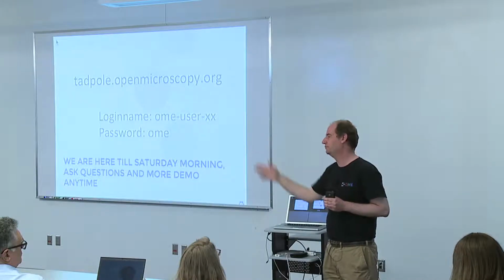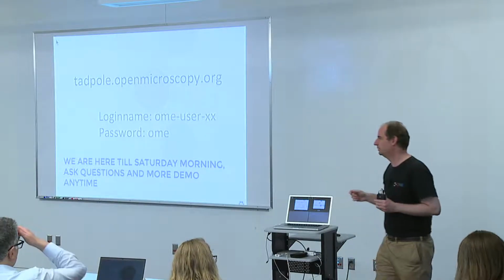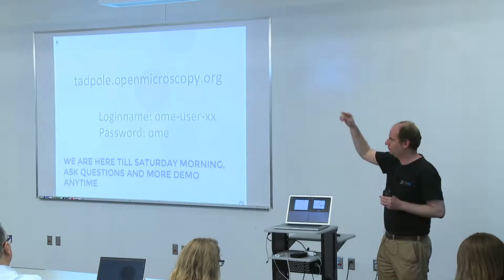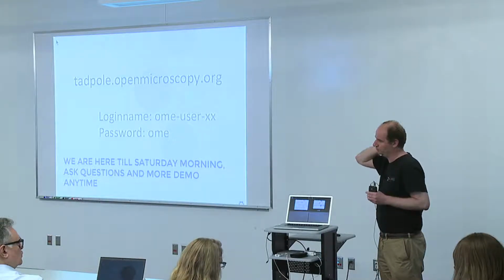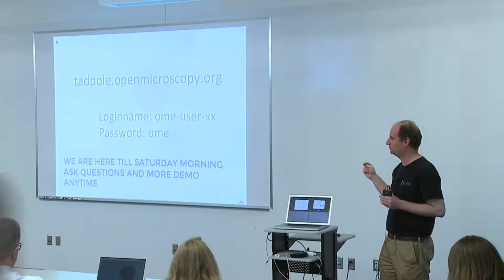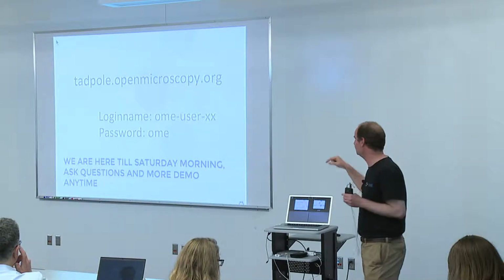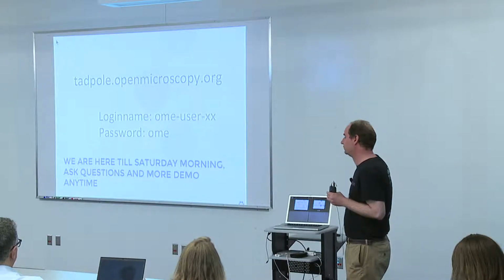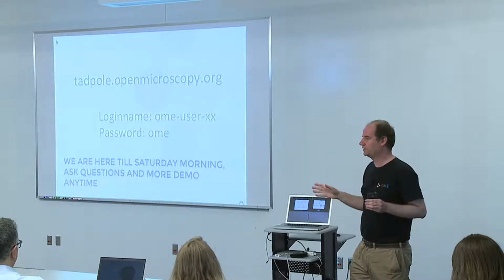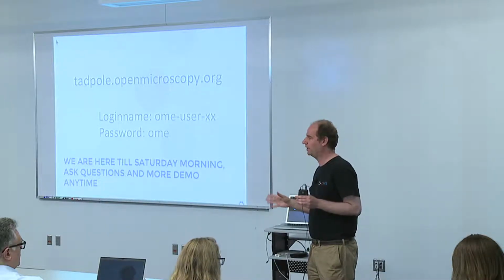Now each of you will have a user name and password according to the small cards, the visit cards, Dominik distributed, and you would have followed the workflow to get into the Open Microscopy network. This will kick you out of the normal internet. So if you can survive without internet for 1.5 hours, then I would ask you to go there and to connect to the Open Microscopy network. Then the question is, of course, next, did you download the two clients, OMERO Insight and OMERO Insight plugin for ImageJ?